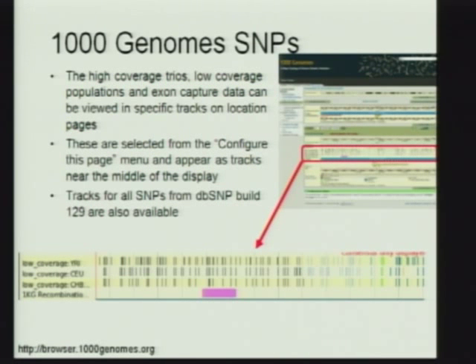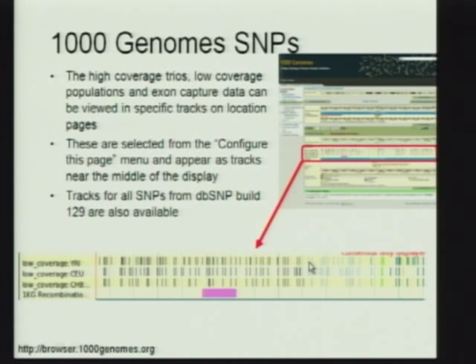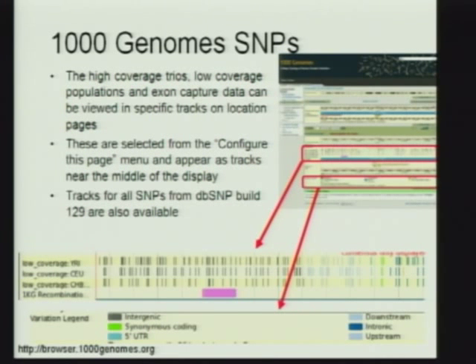The SNP tracks are based on the populations. Here's an example of what they look like and where they are on the page when you zoom in and take a look at them. Here we have three of the SNP tracks, and the recombination hotspots are also displayed. The SNPs turn different colors — the colors are associated with how they're annotated within genes. In this case, these SNPs are just upstream of a gene, so when we have these light blue SNPs, those are color-coded for upstream of genes.